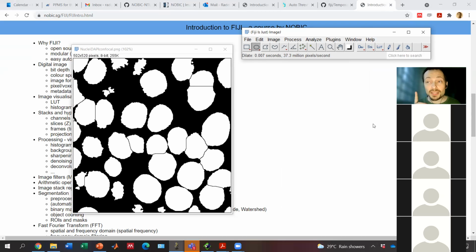But you may have noticed there was one small dot here, which was so small that when I shrunk everything, this small object disappeared. So now when I do the reverse, the dilation, because this object disappeared, it's gone. So you see that it's not always perfectly reversible.